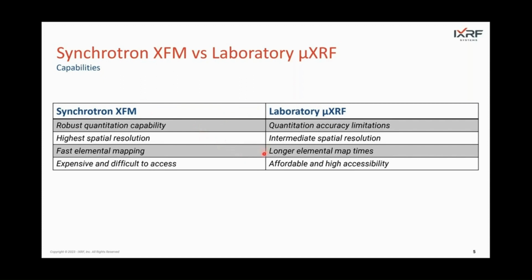However, the accessibility and high volume use afforded by lab-based systems may in many ways make up for these differences and still allow answers to scientific questions in a more timely, affordable manner. Additionally, lab-based micro-XRF can be used to properly inform more effective design of experiment for follow-on synchrotron XFM use when it is accessible.